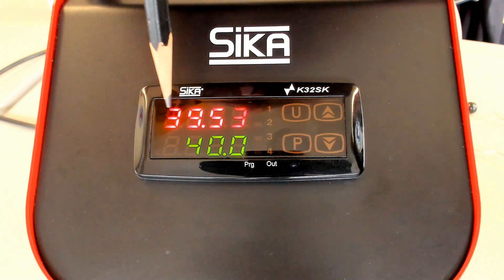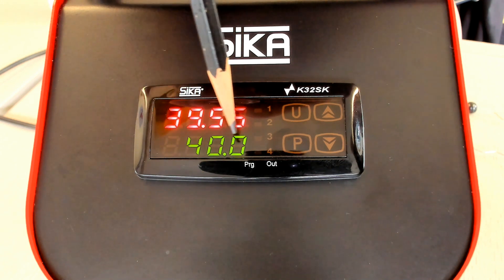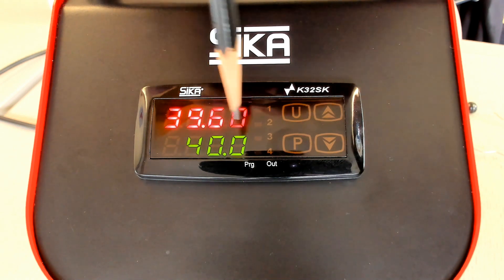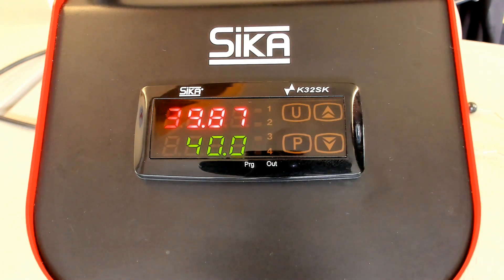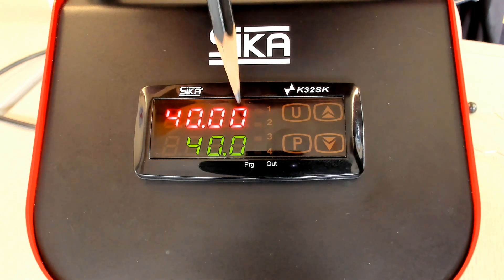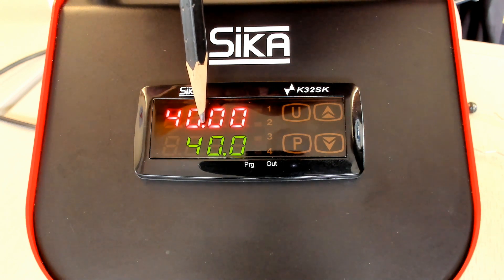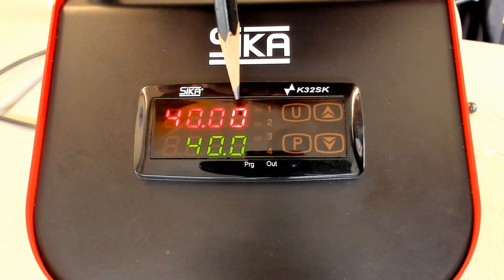On the upper line you see the current temperature value of the block. In the lower line, you see the current adjusted set point. So the set point is 40.0 degrees Celsius, and the current temperature of the block is 40.00 centigrade. You can see we have a decimal point and two digits after the decimal point — this is a clear indication that we have a TP solid calibrator in front of us.